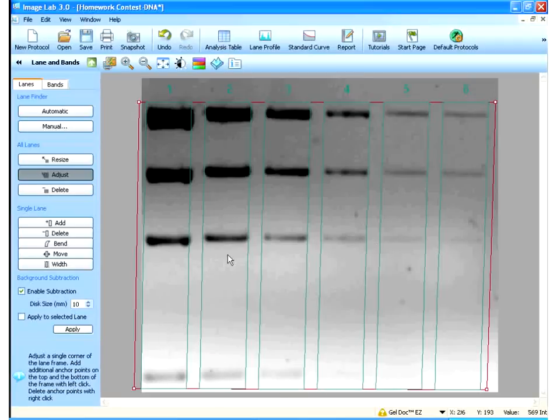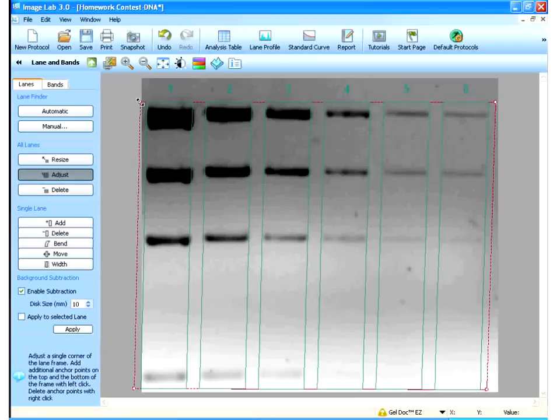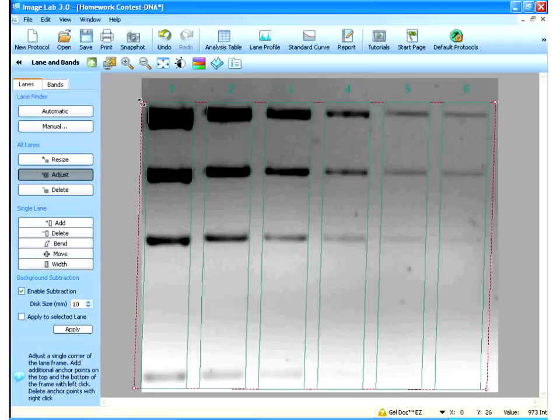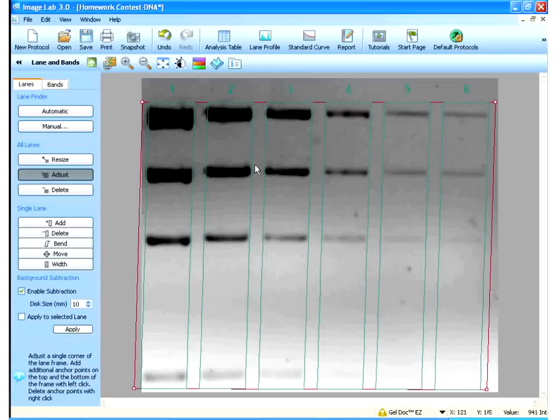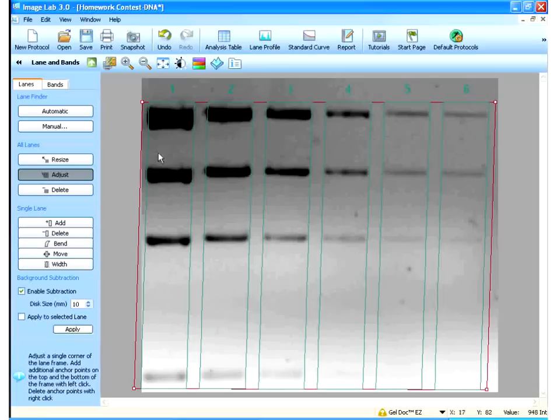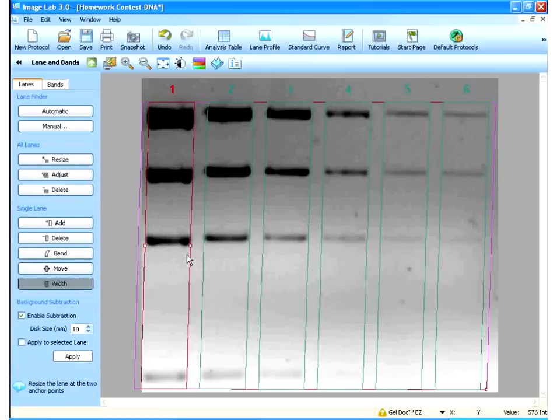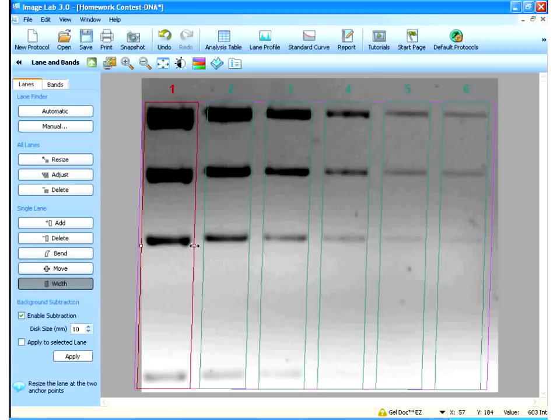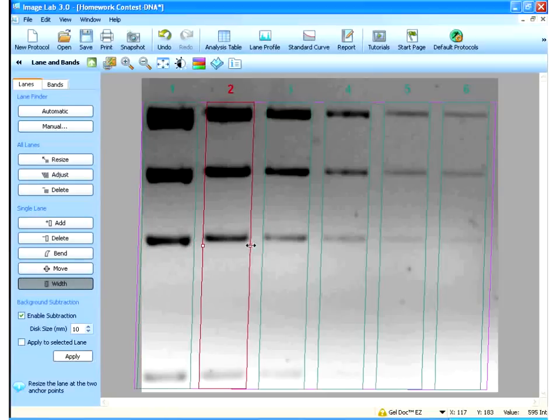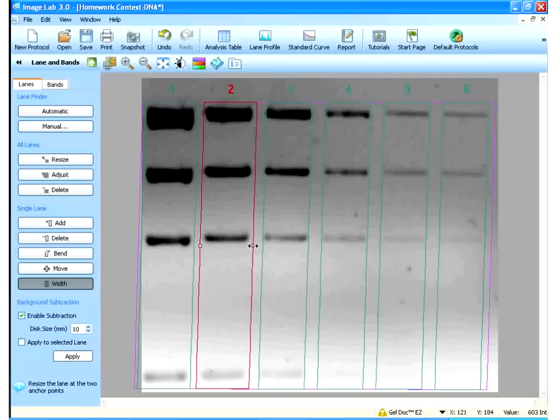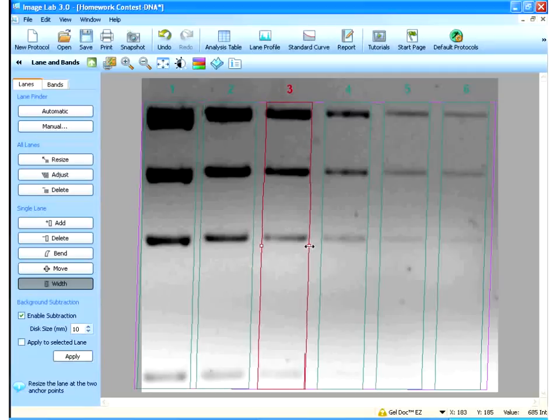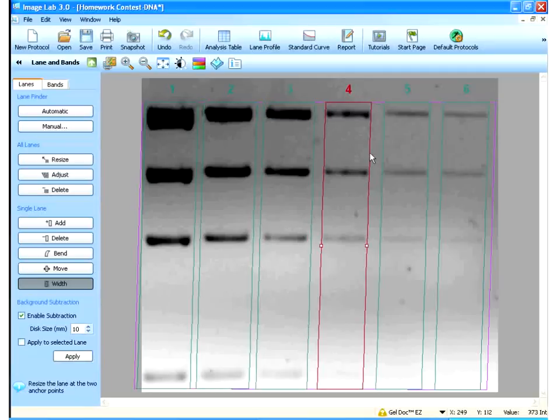And so, now all these bands here are getting much better. If I bend this over a little bit. There we go. And now I've centered these bands. And these are mostly centered. So, not bad. We're getting somewhere. Using the All Lanes tools. Now, I'd like to adjust certain lanes. So, I'm going to go to the Single Lane tool and I'm going to adjust the width of certain lanes. If I click on a lane, I can actually make the lane a little bit bigger to adjust the width.